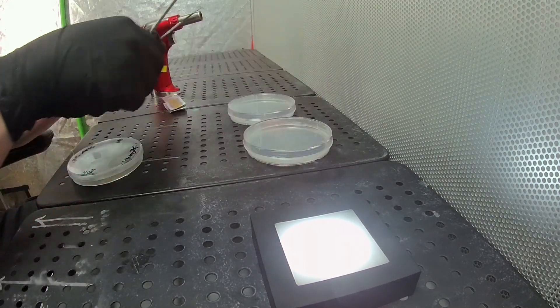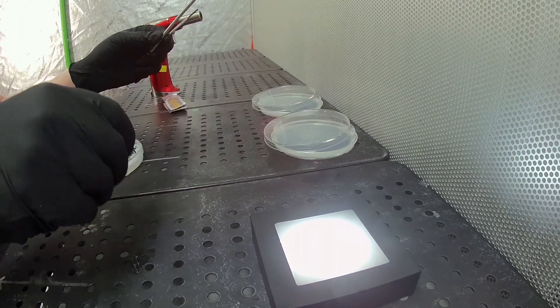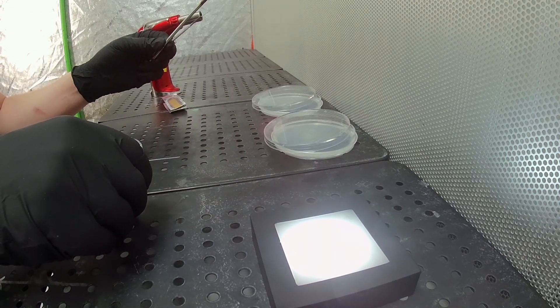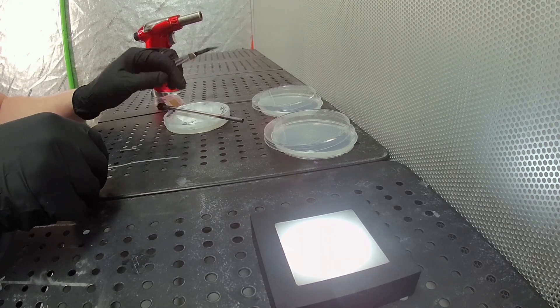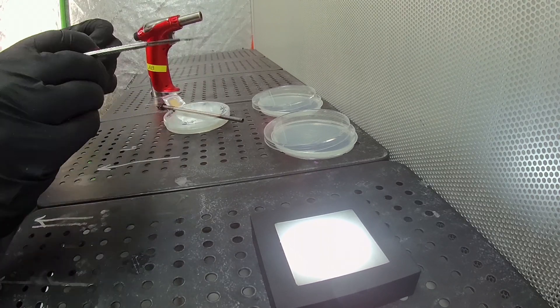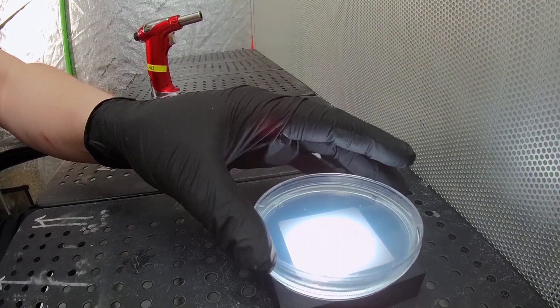First thing, of course, we sterilize our scalpel and our punch. We're going to do our prep work here first — cut a simple trench in one plate and remove a cavity in the other, for placing our sample into, for both cabin sequestering and trenching.